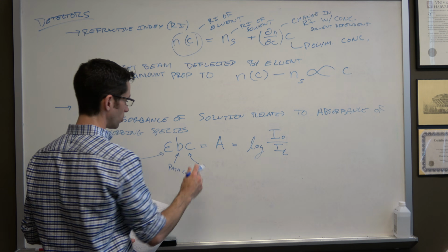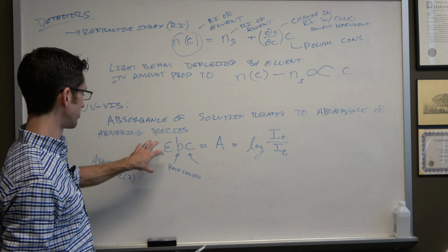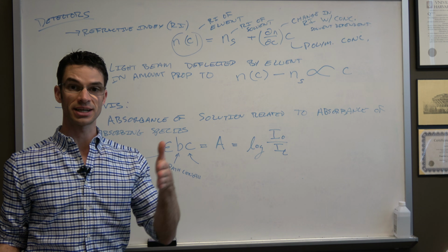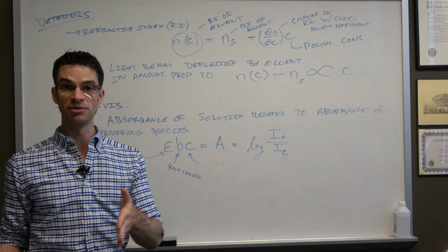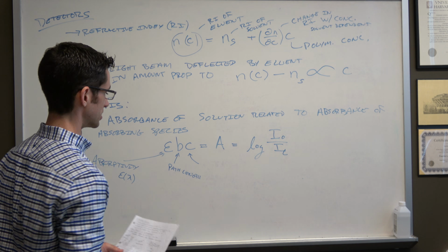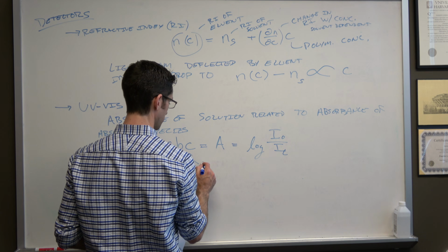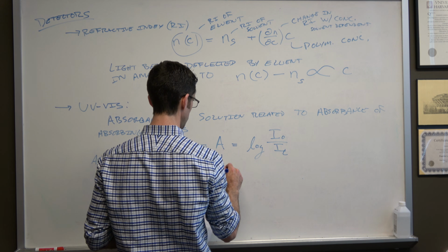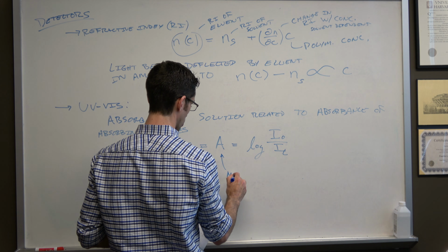You can set this at a specific wavelength, or you might have a monochromator in your system that can actually give you a UV-vis spectrum for every fraction of material that comes out of the column, which is a great capability. C is the concentration. A is the measured absorbance.